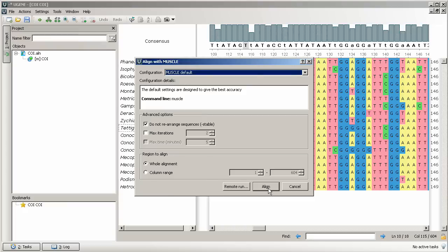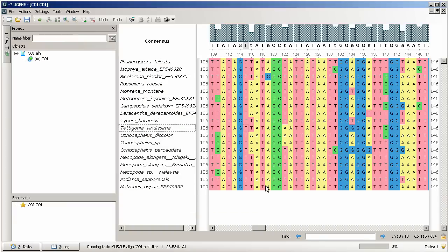Set advanced algorithm options if needed and select a region to align. To start the align, click Align button. We also see a remote run button which we will discuss later in the podcast.